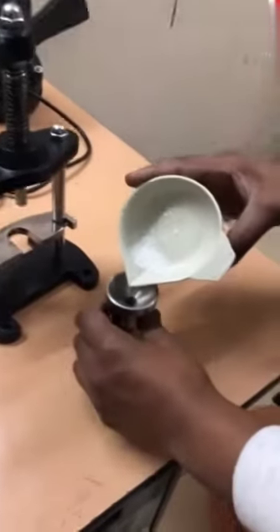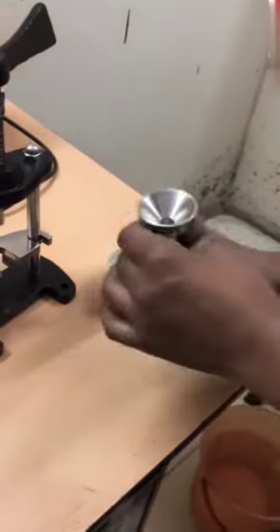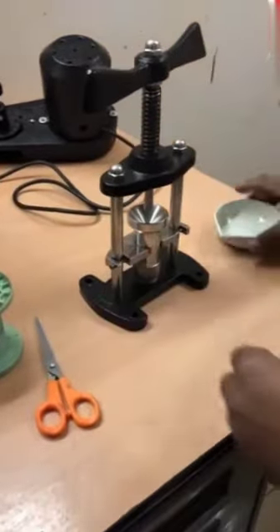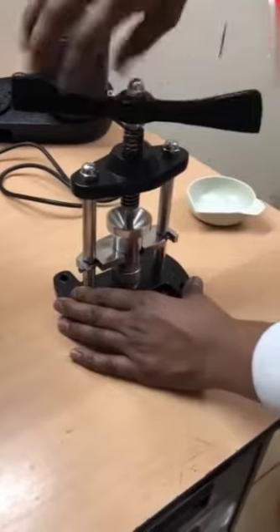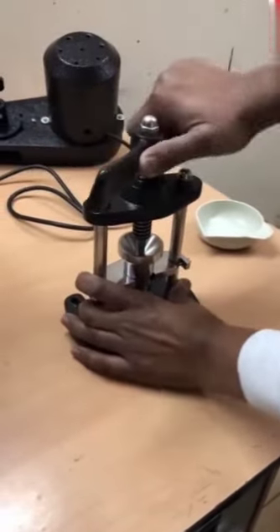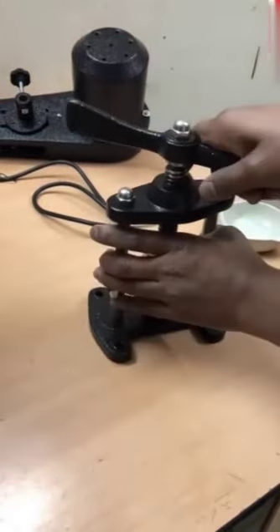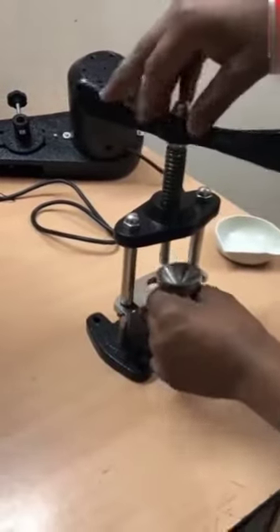Now for the pellet — this is the pellet press cup. Pour all the sample. Now we know one thing: the pellet cannot be more than 1.060 grams, because this is the total weight. Now I will show how this pellet press is used. This is the screw-type pellet press — we will just keep it tight. The sample gets compressed. Now we will open it; the sample is compressed.